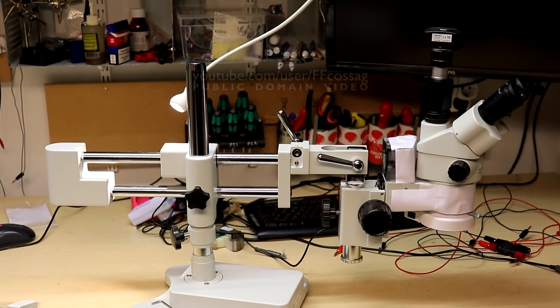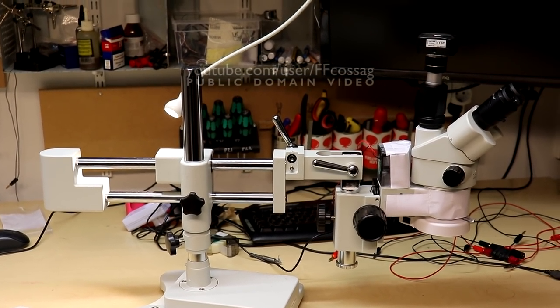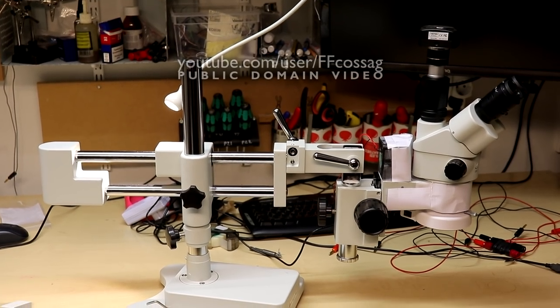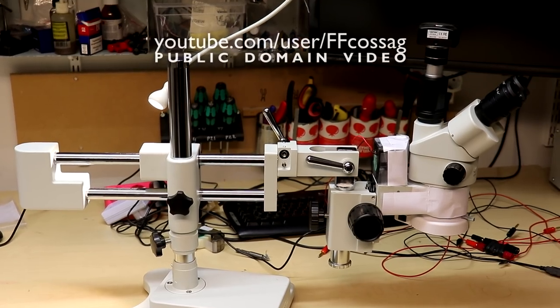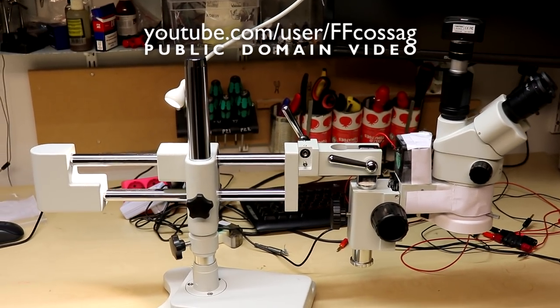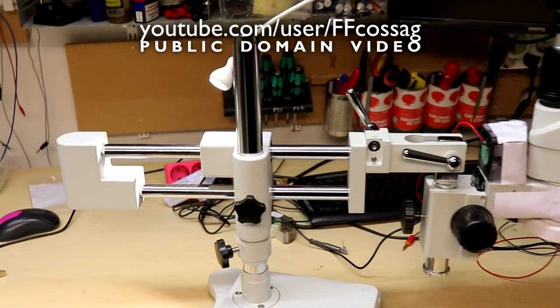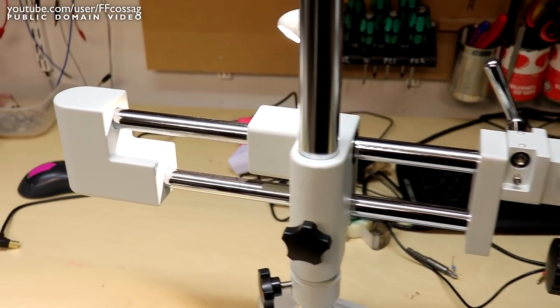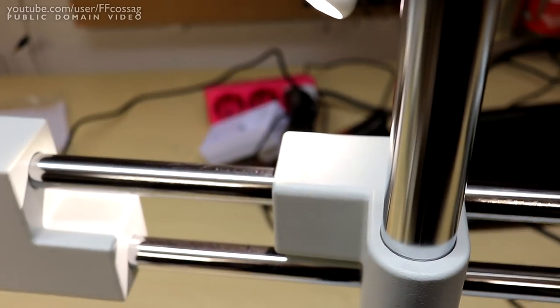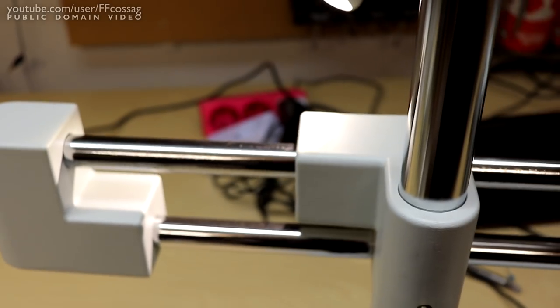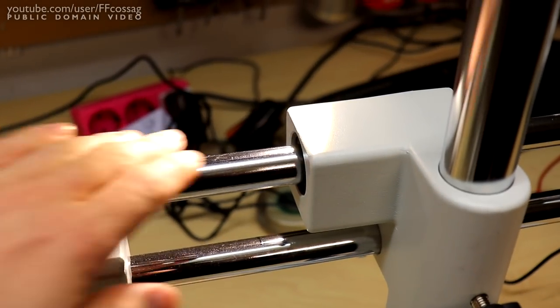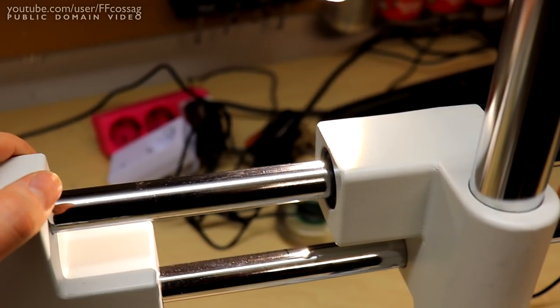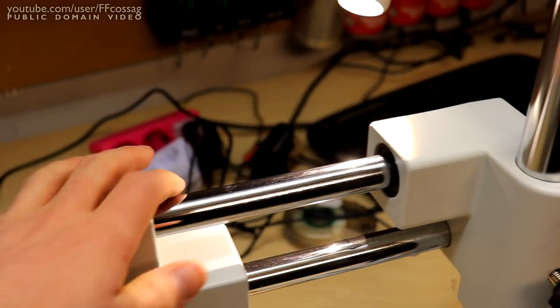A while back I got this Amscope microscope with a double boom arm, and shortly after arriving it ran into issues with the boom arm. These arms have had an issue for many years where the material they've used for the rod is just not good enough quality, it's not hard enough metal to actually support the microscope.